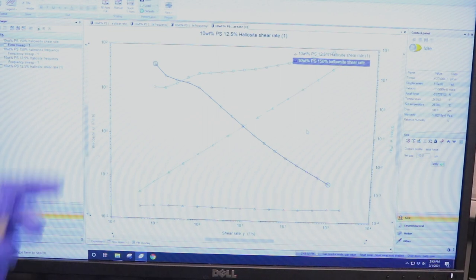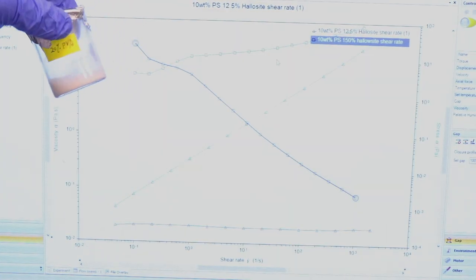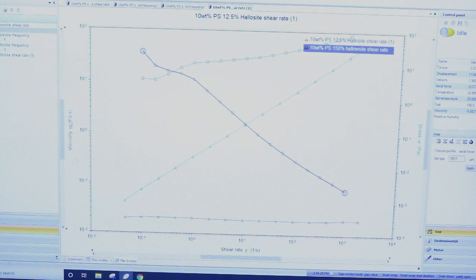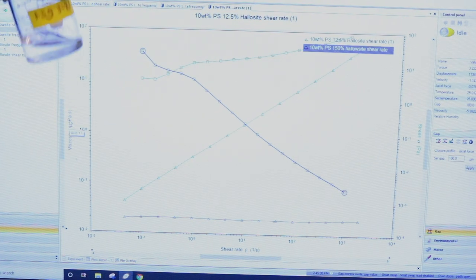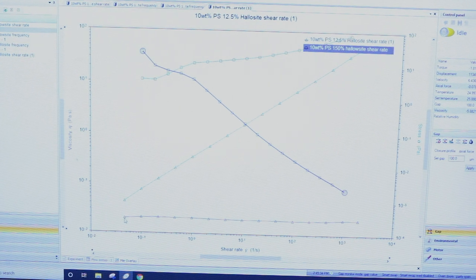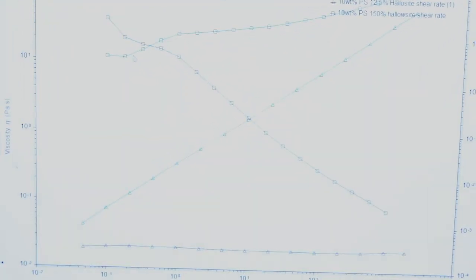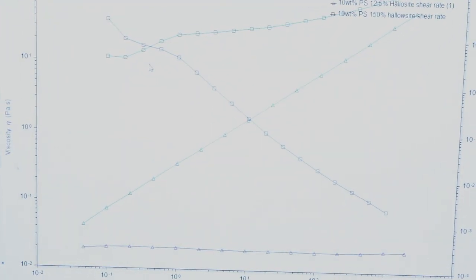So here's the result. As you can see, the highlighted line is for the more solid-like material. It has a much higher viscosity compared to the more diluted polymer solution. So this would help us to study the processability of these two kinds of material during 3D printing.